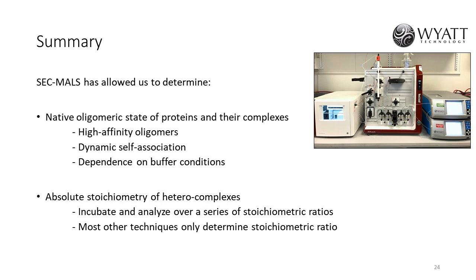Okay, thanks. So how can the MALS be explained as a tetramer, even if the MALS signal is fairly far away from the tetramer line? Maybe a trimer? Yes. For most systems we would agree with that, but the NAP proteins that we work with are constitutive dimers.